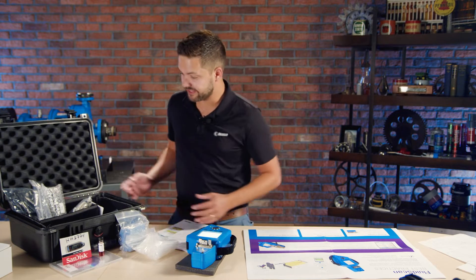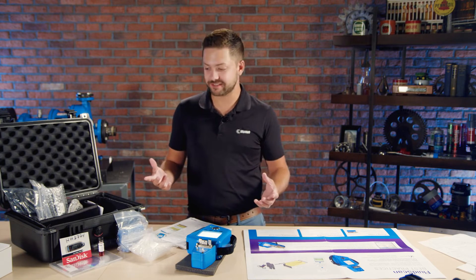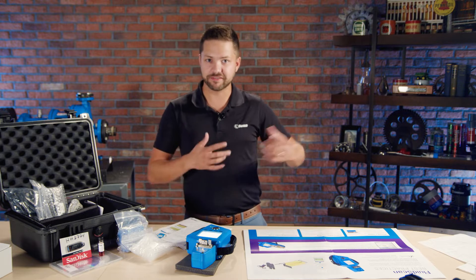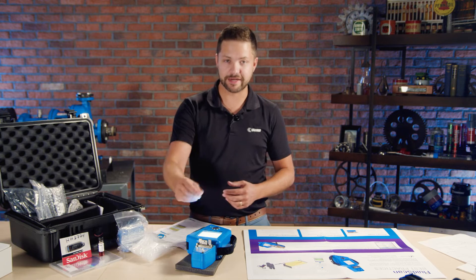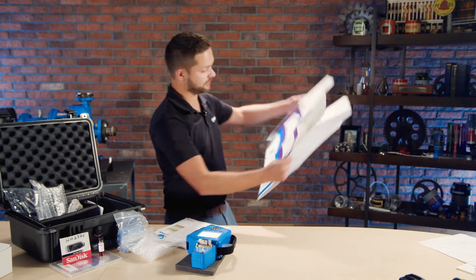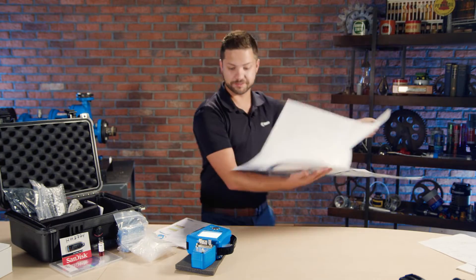Of course it came in a nice case and there are a few cables to charge it, plus a cable to connect it to your computer. One thing you won't notice is any solvents or other liquids — it's actually very simple. You don't need a solvent or any sophisticated process; all you need is to wipe it down between each sample and use a couple of drops. You also get a nice poster with a lot of detail — I'll be putting this on my wall later.